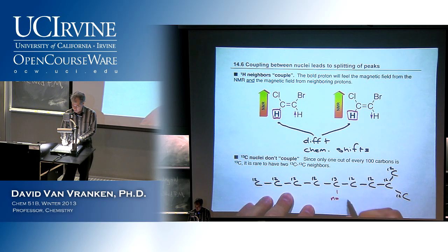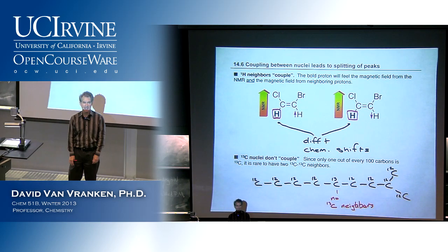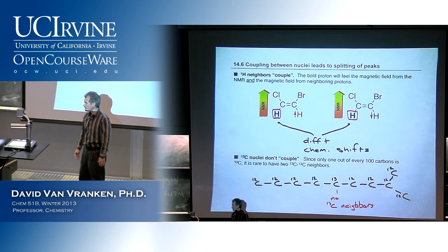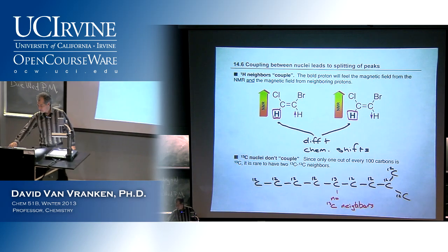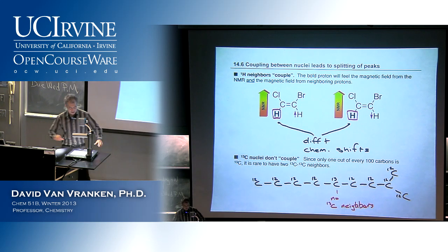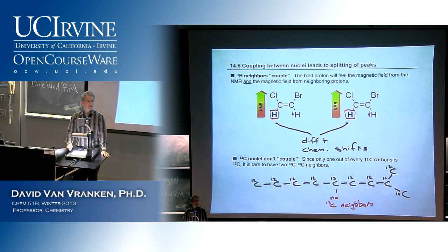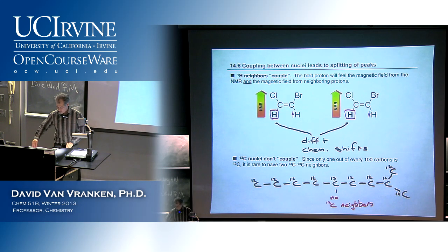So I'll just write here, no 13C neighbor. On average, that's supposed to be an H there. On average, the typical C13 molecule will not have another carbon 13 neighbor. That just doesn't happen. So we never had to worry about this splitting effect with carbon 13 NMR spectroscopy. That was never an issue for us. So what a wonderful situation for carbon NMR, and that's why I started with carbon NMR. It makes the interpretation of the spectra very simple.